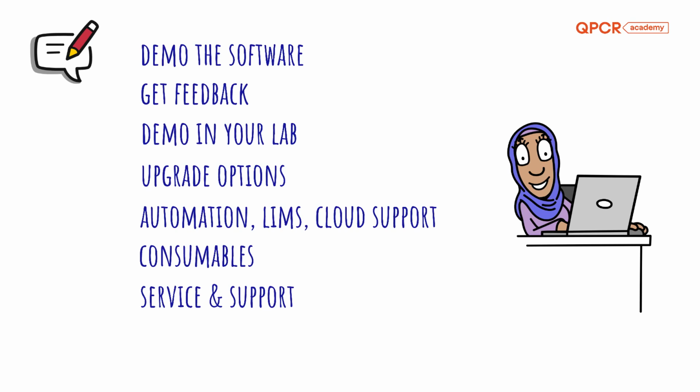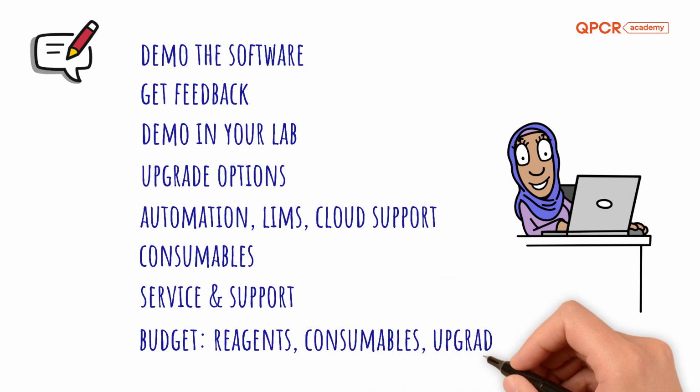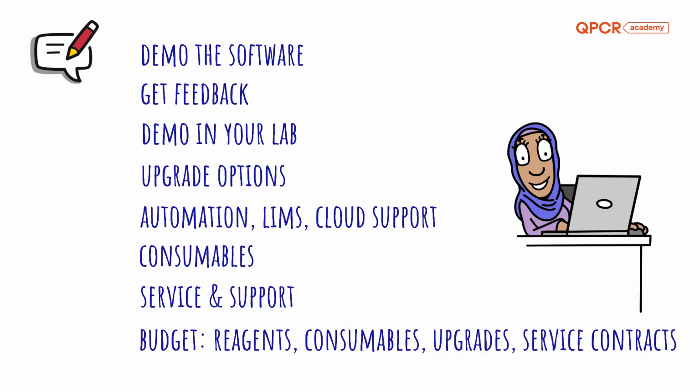Factor in service and support. Fast repairs, local techs, and training can minimize downtime. And of course, don't forget to budget for the full picture: reagents, consumables, upgrades, and service contracts. The right qPCR system will grow with your research and support your lab's success for years to come.